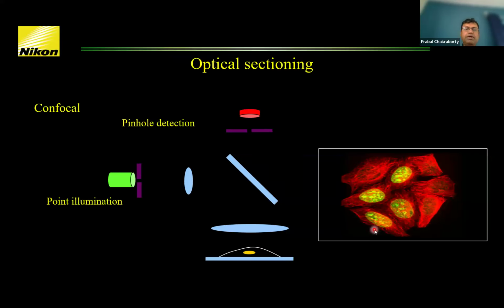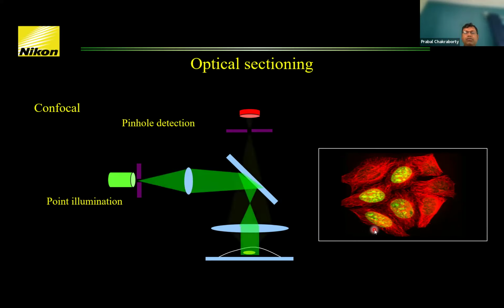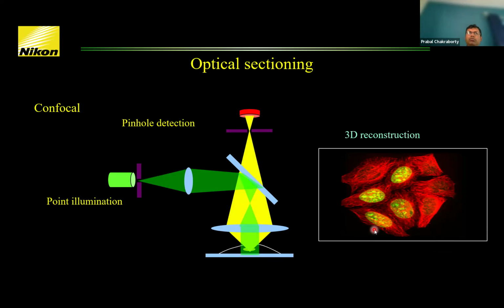Another very big advantage of confocal microscopy is that we can capture information along the z layers of the sample. Light is focused at a particular focal point. If we move the focal point along the z axis of the sample, we can scan a particular plane, store the data in the computer, then go to another layer and collect the information.